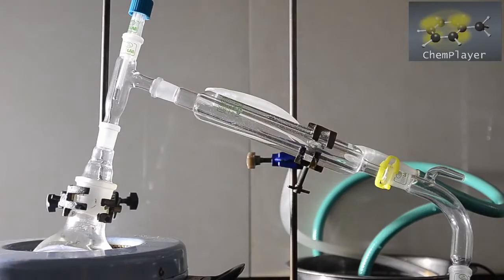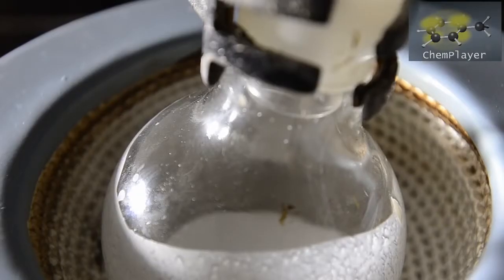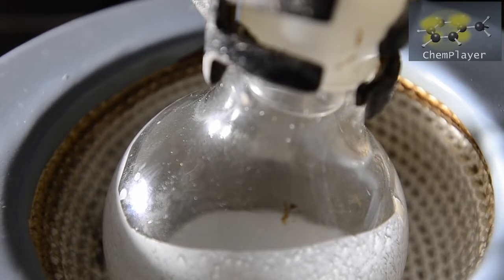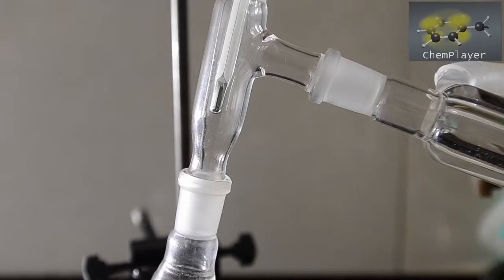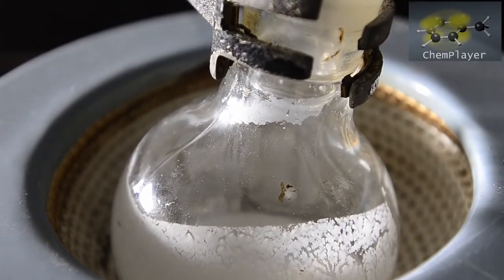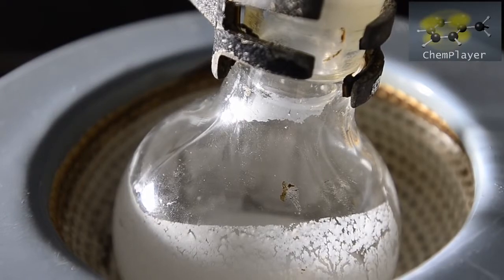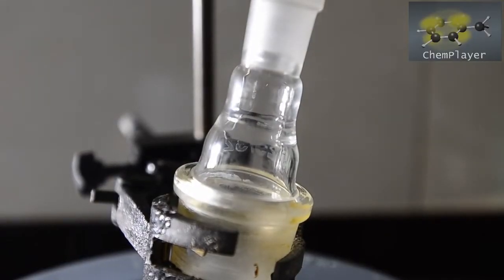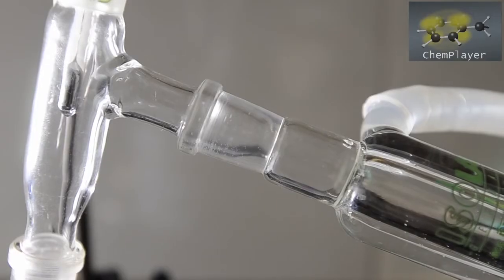We set up to distill the flask contents using a simple distillation setup. Some strong heating was required before anything in the flask was visibly refluxing. But after about 10 minutes we noticed some drops of liquid on the inside of the flask, and then slowly creeping up the still head. To begin with we collected just a few mils of liquid which came off below 150 degrees C.